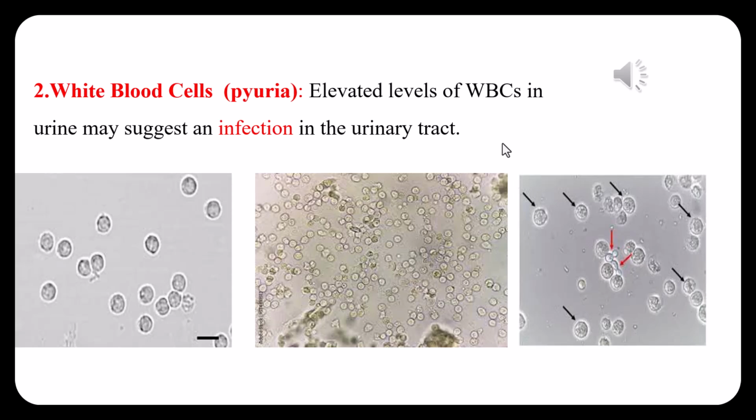Also, we can say there is a pus cell, which has engulfed the microorganism, maybe bacteria or any kind of microorganism. We call it here pus. There is a pus cell under the microscope, you can see in this picture.